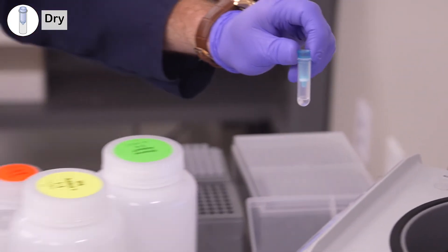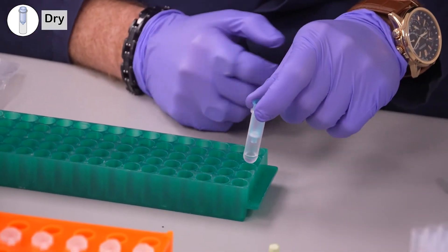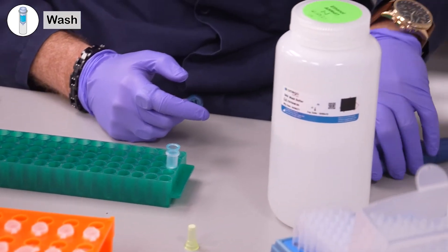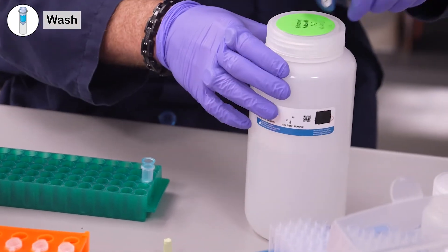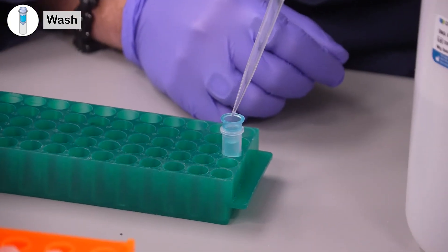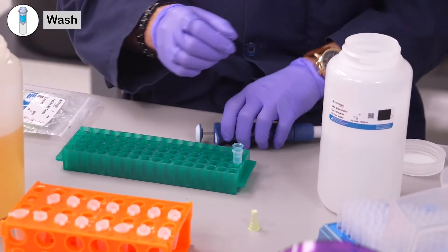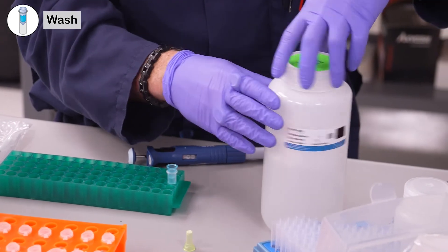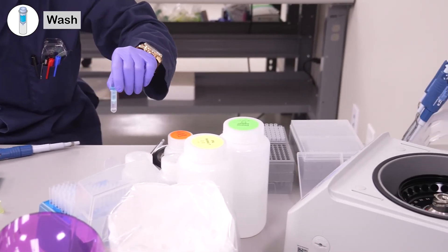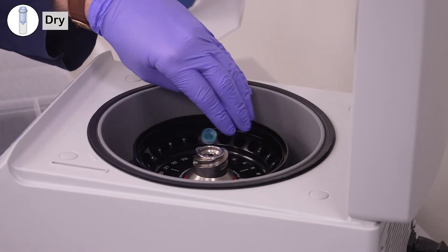Because there's so little liquid, you don't actually have to dump the flow-through at this point. Just add 400 microliters of DNA wash buffer right on top, then centrifuge one more time for two minutes to make sure that all the residual alcohol gets washed off the column.